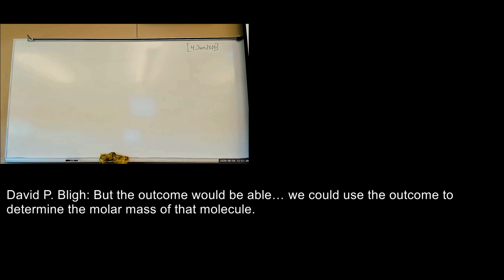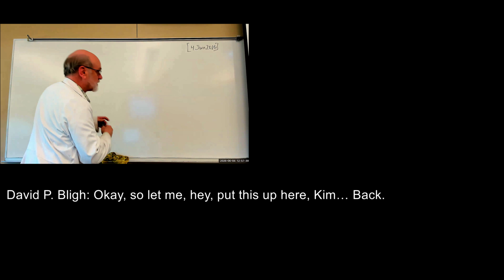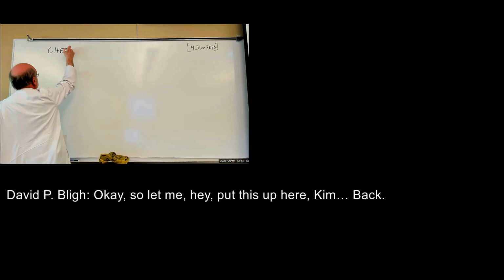We could use the outcome to determine the molar mass of that molecule, regardless of what it is. Okay, so let me put this up here.